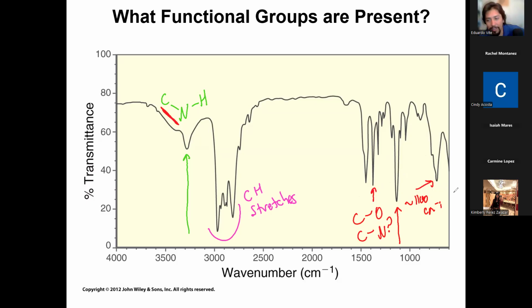That would be a good guess, like, oh, I'm trying to see if this makes any sense. Yes, that would be a good guess as well. But again, the confidence for that would be a lot lower, so I probably wouldn't put it on my lab report. I would only really say the NH stretch for sure. And that's all we can learn.